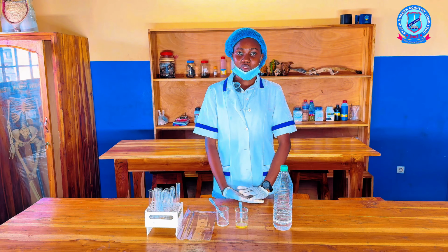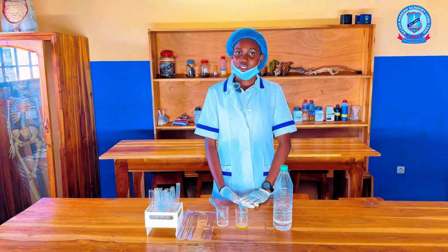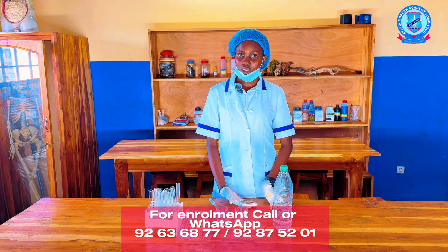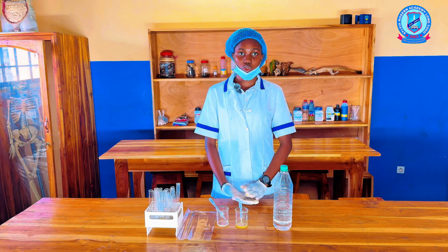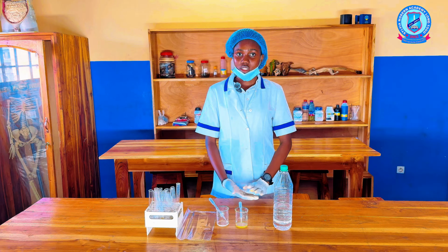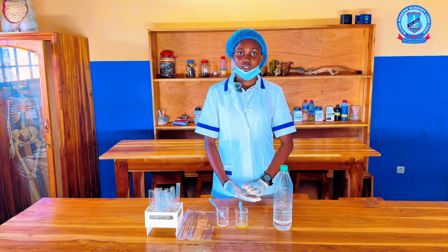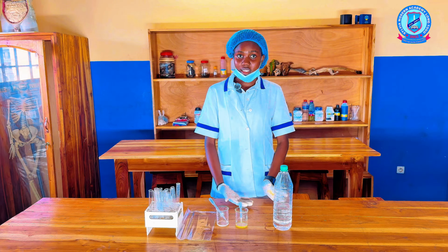So viewers, we successfully carried out the food test using different food samples to test for starch, protein, and lipids using the iodine solution, ethanol emulsion test, and the xanthoproteic reagent, which is also known as nitric acid. The changes in color observed in these food tests have helped us to confirm the presence of nutrients in these food samples, and why a balanced diet is important in our daily lives.